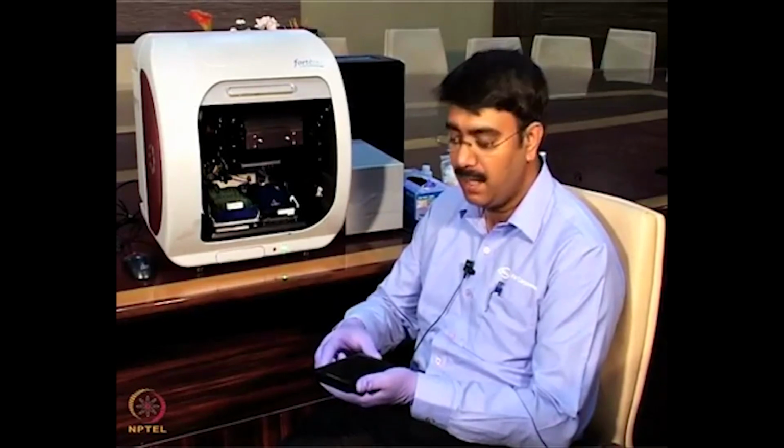Here I am using biotinylated protein A as a ligand, at a concentration of 10 microgram per ml. I am putting 10 microgram per ml into 6 wells, and using mouse monoclonal antibody as the analyte. I am taking the starting concentration at 25 microgram per ml. I am going to do a serial twofold dilution from 25 to 12.5, and so on, for 6 data points.